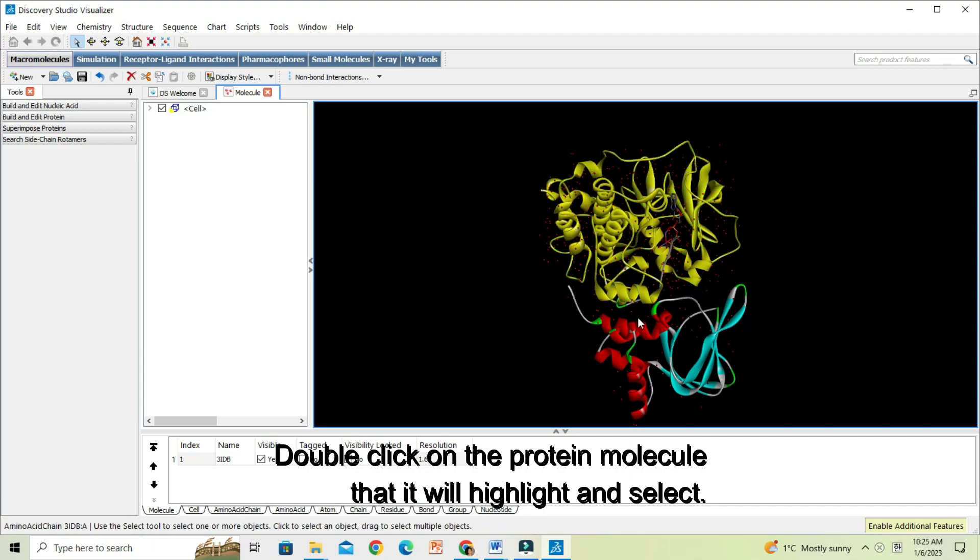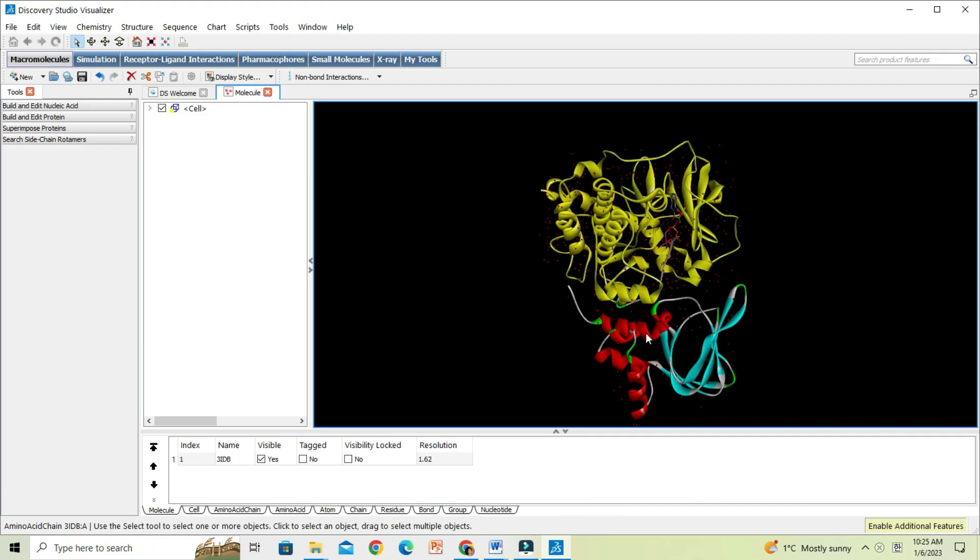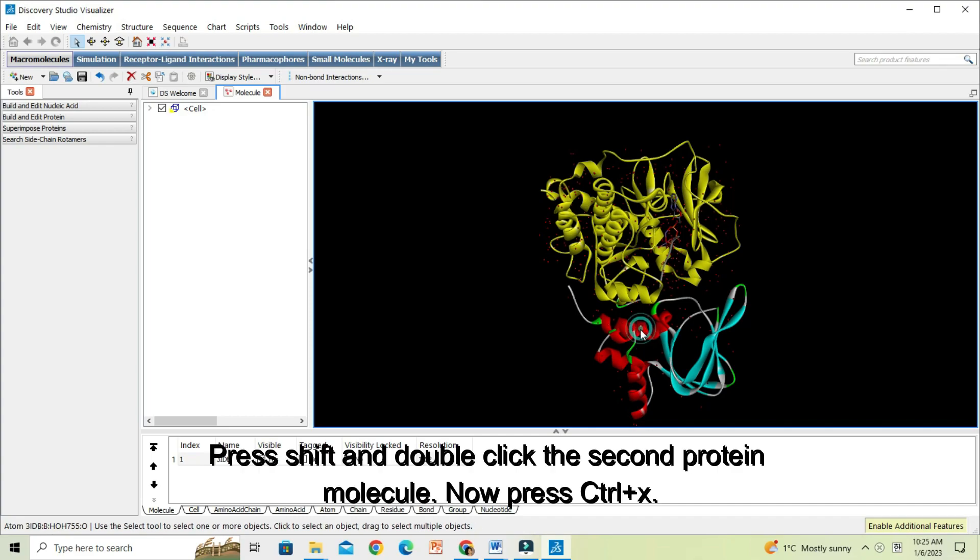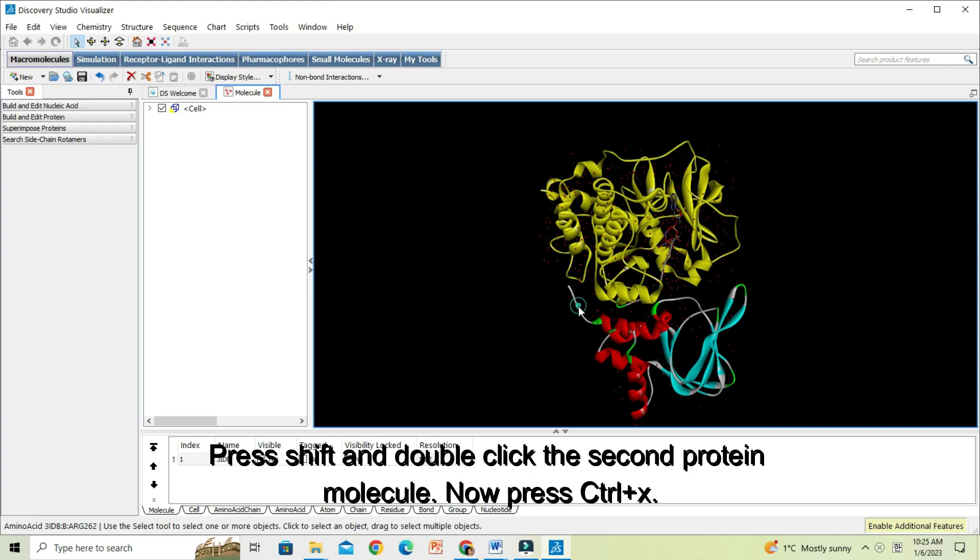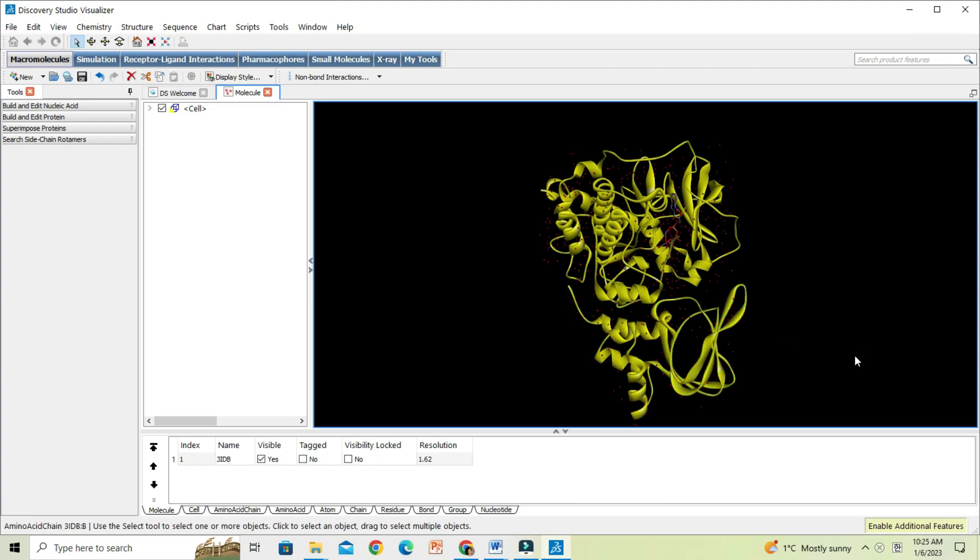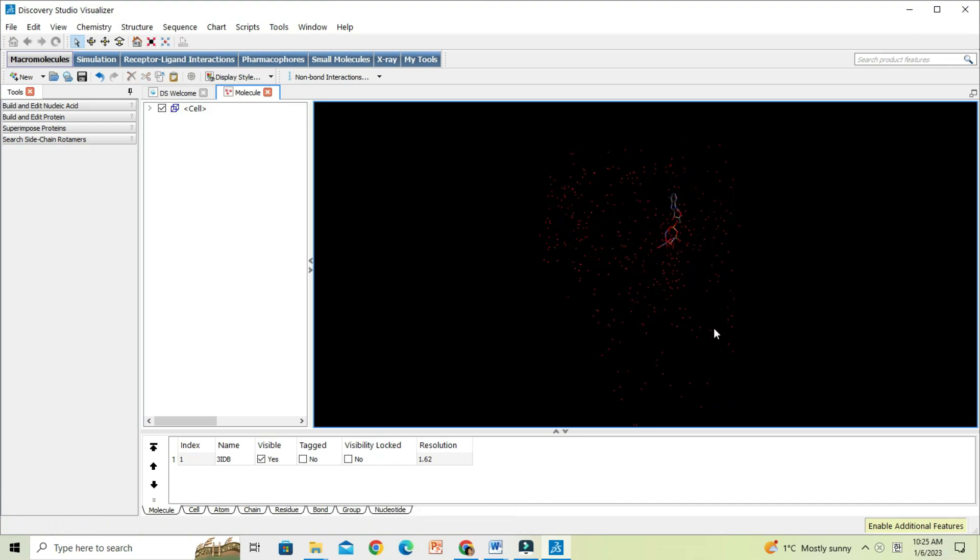Then to select the second protein molecule of the heterodimer, I will press Shift and select the protein molecule. Now press Ctrl X to cut off the selected molecule from the molecule window.